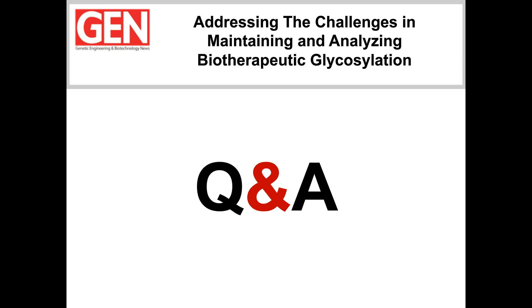Thank you very much. And Shahir, Glycan Assure shows Fc glycosylation, but where would the sialylated glycans elute? How well does it separate monosialylated to tetrasialylated? So I partially answered this earlier. The sialylated glycans come first in our CE systems. The higher the negative charge, the faster they move. So for example, in the case of the fetuin, which is a highly sialylated glycoprotein, we start seeing from the pentasialylated ones, and then we see the tetra and the tri and the di and mono, and then at the end we see the neutral glycan.